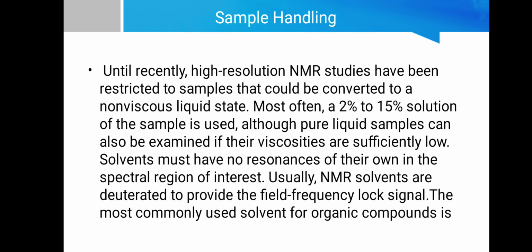Sample handling. Until recently, high resolution NMR studies have been restricted to samples that could be converted to a non-viscous liquid state. Most often a 2% to 15% solution of the sample is used, although pure liquid samples can also be examined if their viscosities are sufficiently low. Solvents must have no resonances of their own in the spectral region of interest. Usually, the NMR solvents are deuterated to provide the field frequency lock signal.